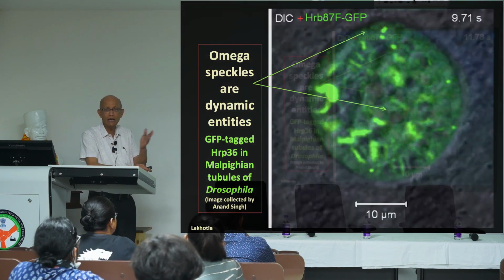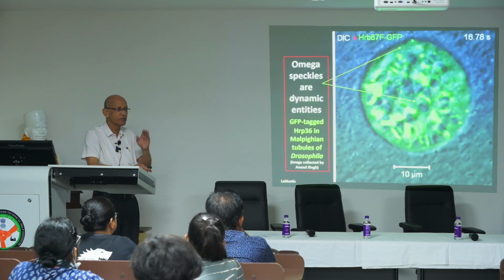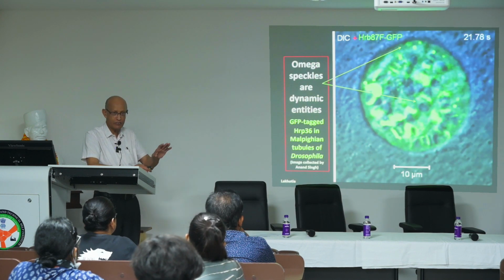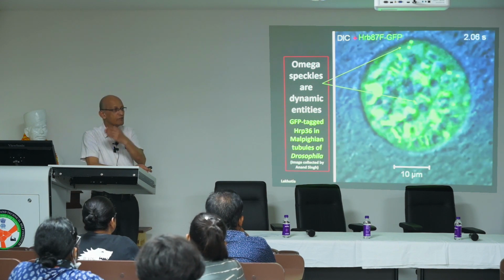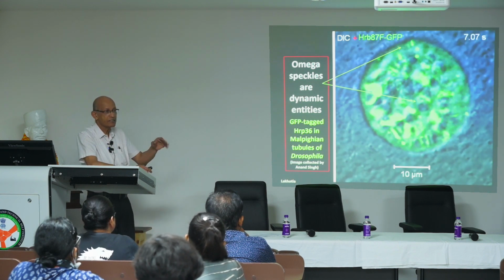All we need to do is time-lapse imaging. So we add a fourth dimension. X, Y, Z is spatial, and then we add a temporal dimension. One second, two seconds, or a fraction of a second later, what happens, and that can be done.